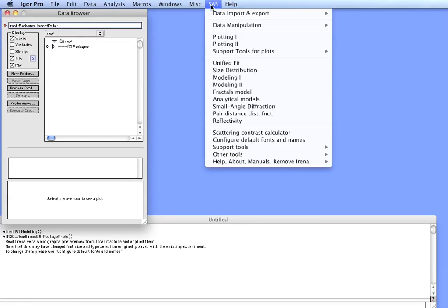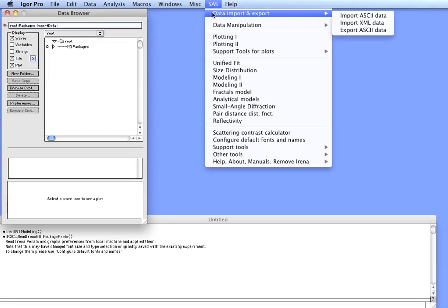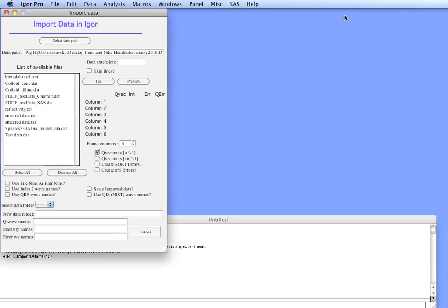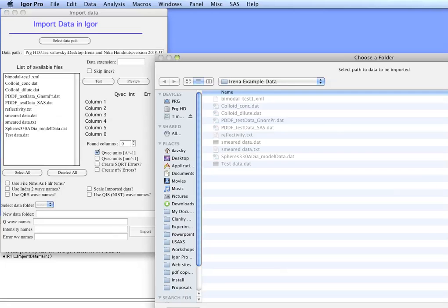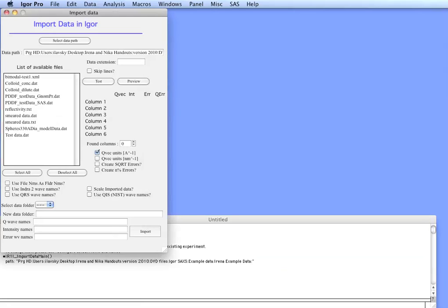Now we need to import data. From the SAS menu we select data import and import ASCII. In this tool we can select the place where the example data are. In this case that's IRENA example data.